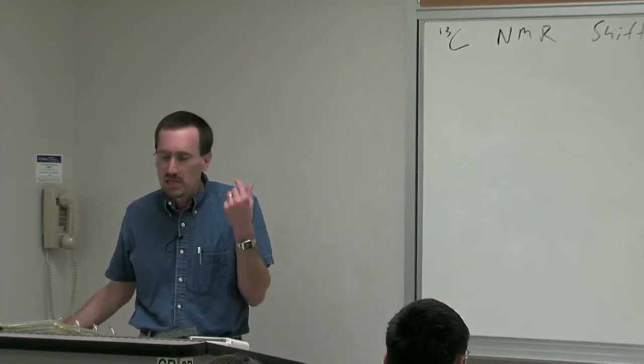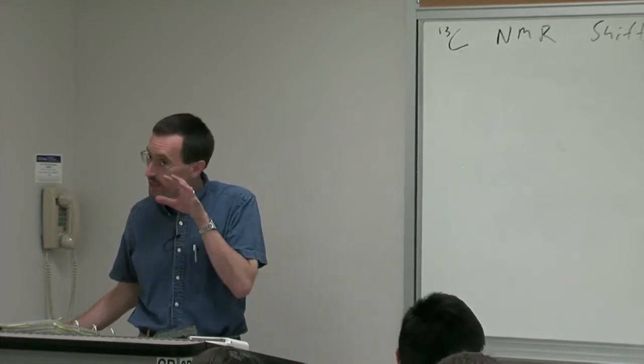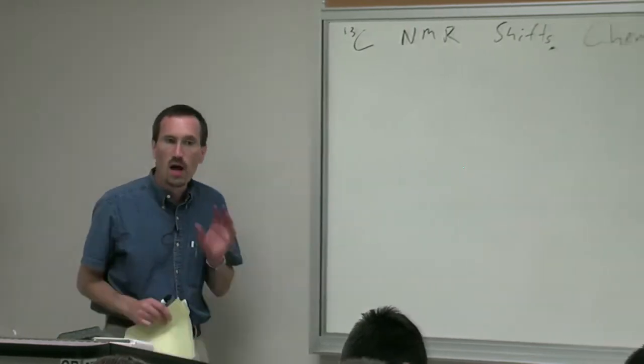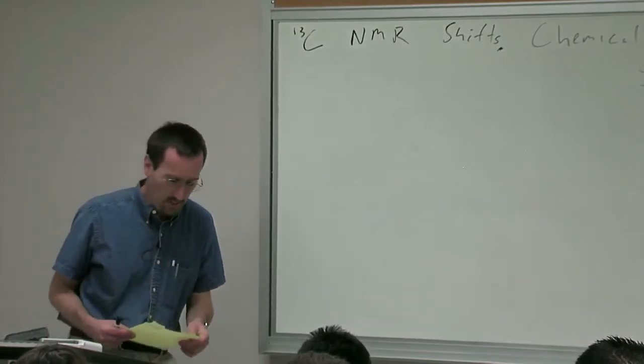Next time, we're going to develop a concept called magnetic equivalence, which is different, an amplification on chemical equivalence, but it's too much to take in one. And then we're going to spend a couple of times talking about details of spin-spin coupling.